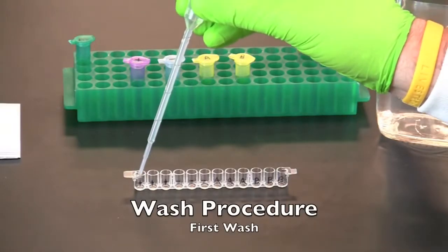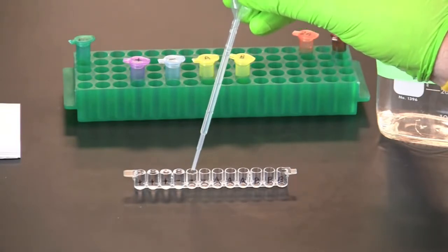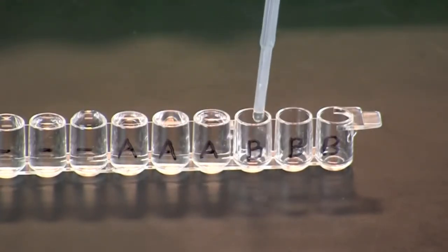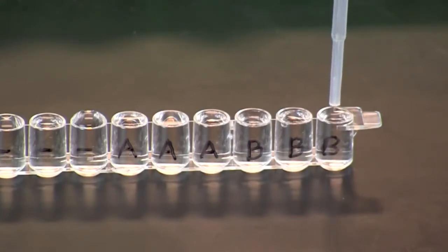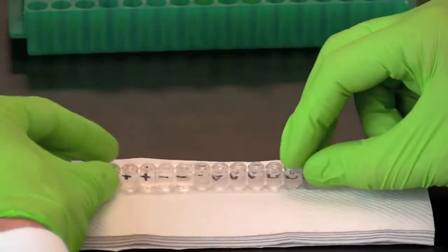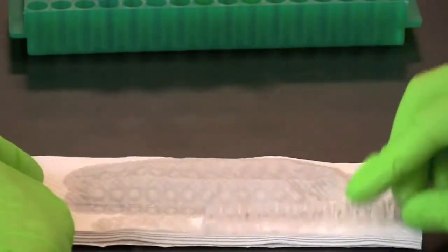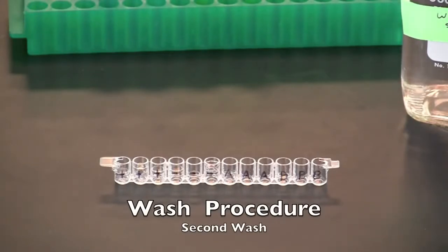Take care not to spill over into neighboring wells. Tip the microplate strip upside down onto a short stack of paper towels and gently tap the strip a few times. Discard the wet paper towels. Repeat the wash procedure for a second wash.